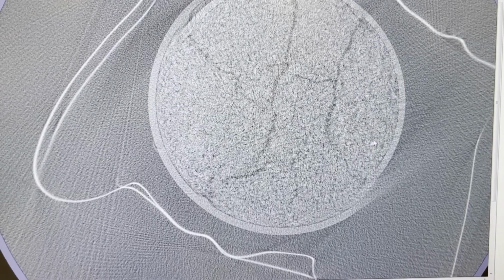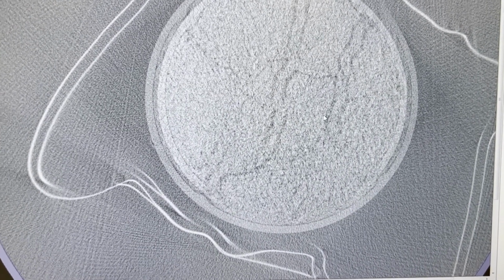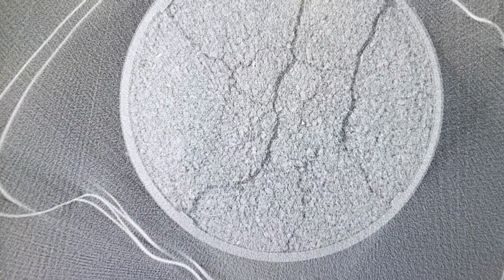So now in the reconstruction, we can start to see the grains of the coffee and some cracks there. Yeah. We're just finding the center of rotation now. Ooh, look at that.